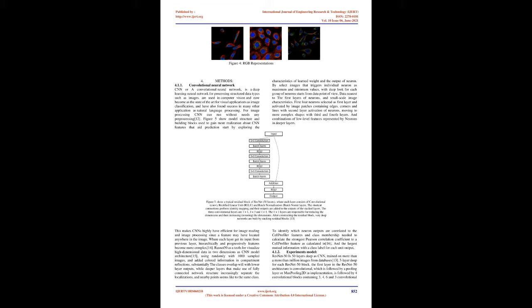So they can be seen as shown in Table 2, the labels, organelles/structures, and in which the proteins are located. Cell 1, green looks to be in the mitochondria. Therefore, the cell-level label is mitochondria. Cell 2, green looks to be in the nucleoplasm. Therefore, the cell-level label is nucleoplasm. Cell 3 and cell 4, green looks to be in the nucleoplasm and mitochondria. Therefore, the cell-level label is nucleoplasm and mitochondria. If there is no green, or green is not present in any organelle, the cell-level label is negative.